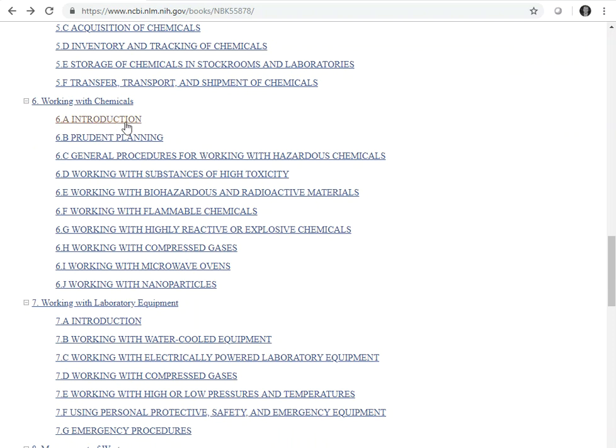Right? So if you've got to work with highly reactive or explosive chemicals, they give you some tidbit of information about what to do. Well, that also includes gases, biohazards, flammables, you name it, it's going to be listed.